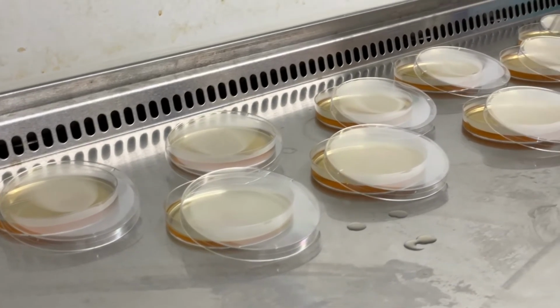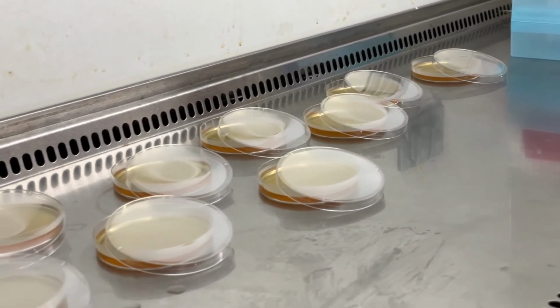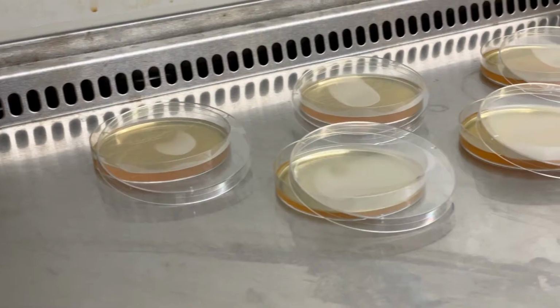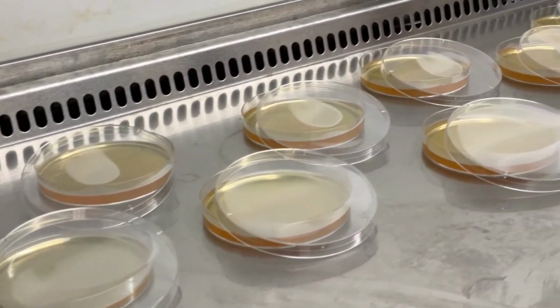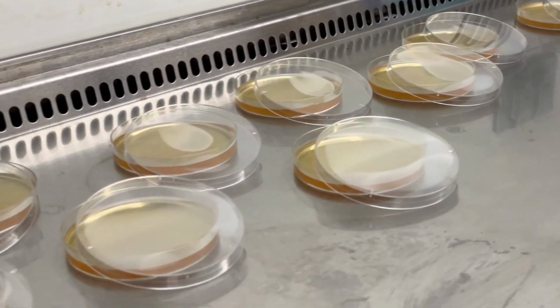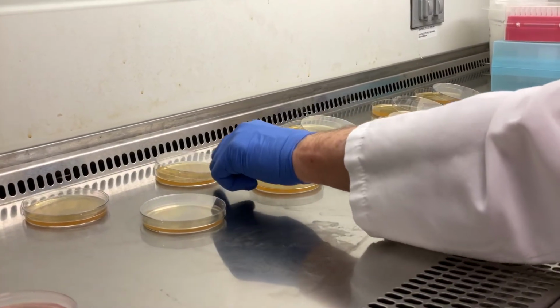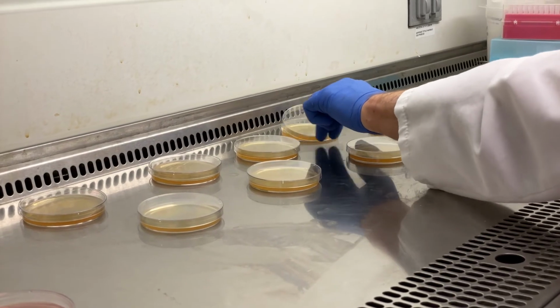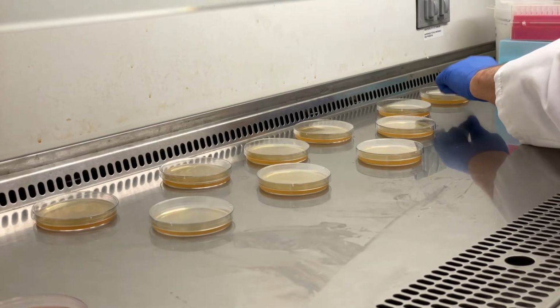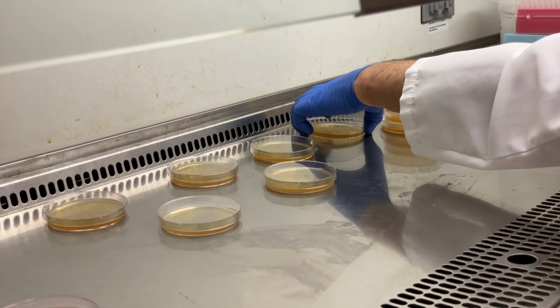One way to avoid the bubbles or the drops in the lids is to, while they're still inverted, take them out of the 4-degree environment, remove the lids while inverted and put a new lid on. That is one way to avoid contamination from the dripping fluid from the stored lids. Again, these can be put into a plastic sleeve and stored inverted at 4 degrees for further use.